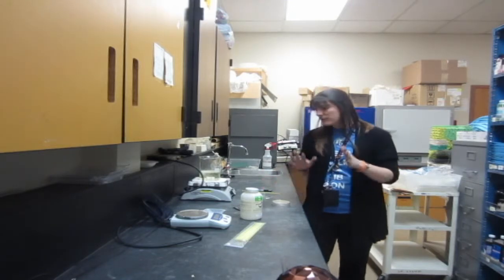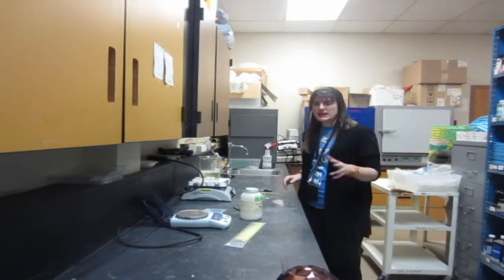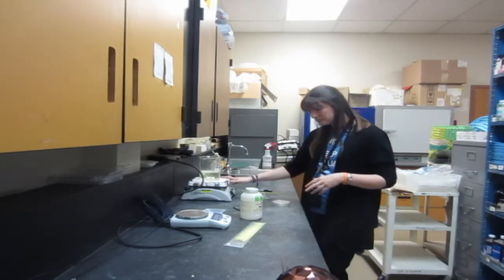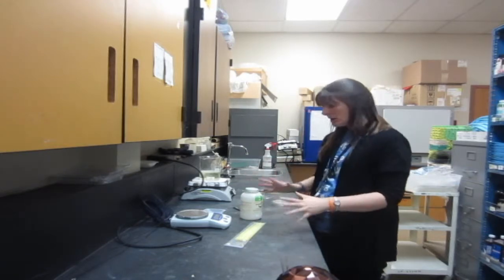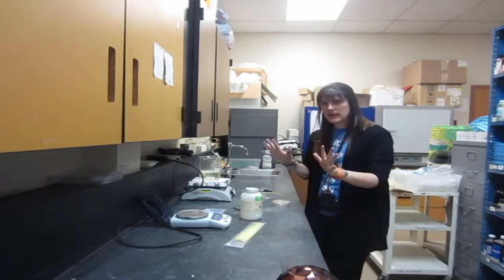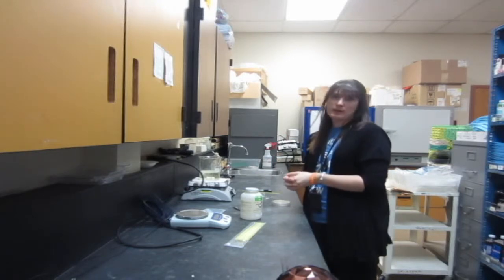When you go to make your agar, the first thing that you want to do is get all the materials that you'll need. You'll need your petri dishes, you'll need a hot plate, you'll need a scale, you'll need the agar, you'll need some inoculating loops. You want to gather all your materials to begin with.